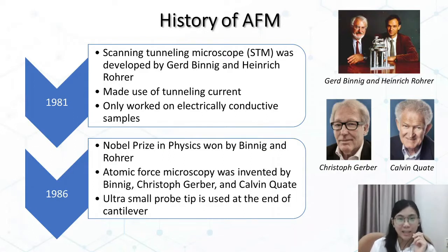In 1986, Binning and Rohrer received the Nobel Prize for the invention and design of STM. Actually, this year, they only received half of the Nobel Prize, while the other half went to Ernst Ruska for his fundamental work in electron optics and for the design of the first electron microscope.